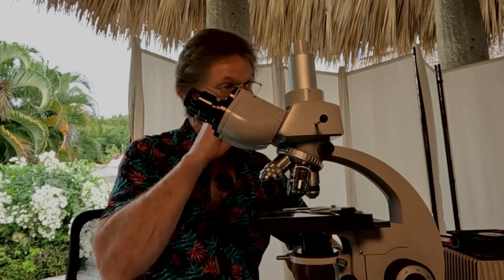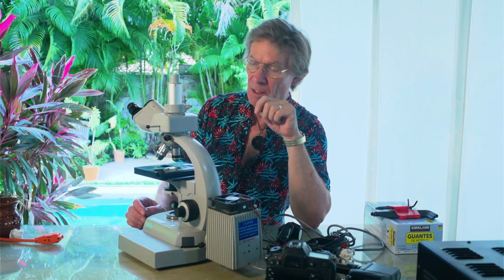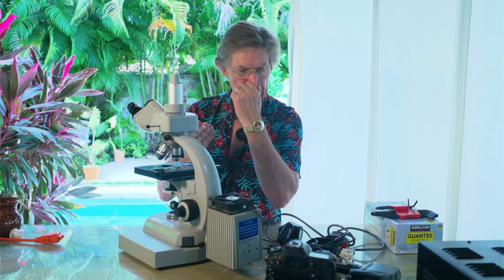Once we get the light flowing, we have to adjust the condenser. Remember that thing that condenses the light into the path that we want. And once we have that set up, we now have to use the focusing mechanism, which is on the body of the microscope, to actually move the objective up and down until we get it accurately focused. And our image through the eyepieces, binoculars, and the camera piece are focused so that we have a detailed image.